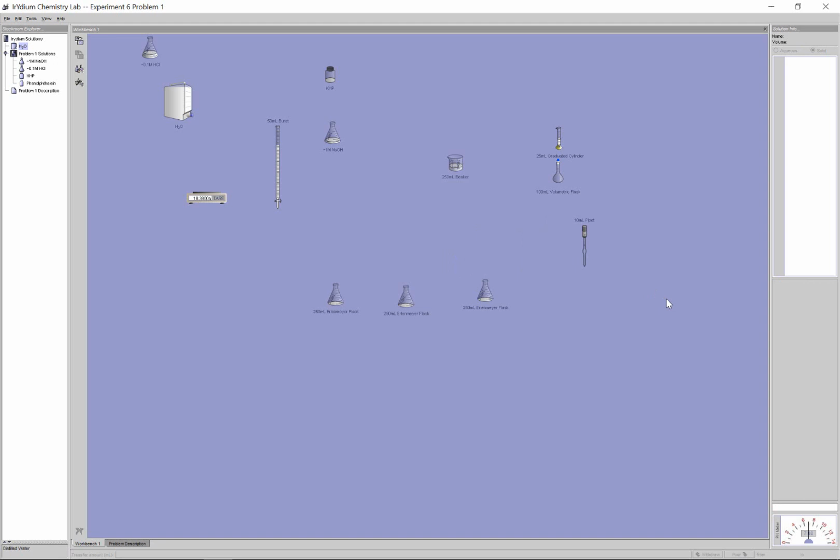We saw one last cheat from yesterday here. Unfortunately, the NaOH as well as the HCl are both colorless solutions. So although I do need the NaOH to slowly count how many acid particles there are, I need something to tell me that the reaction is done. I need something to tell me to stop at this point and then take the volume reading. That thing was an acid-base indicator. The one that we chose was phenolphthalein. Phenolphthalein, I mentioned yesterday, remains colorless when it's in acid. It turns to a pink color when it's in base. You don't need a ton of it, it just needs to be present.